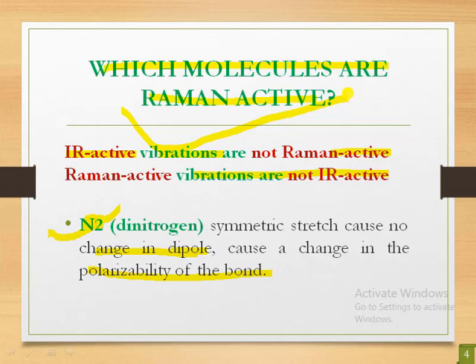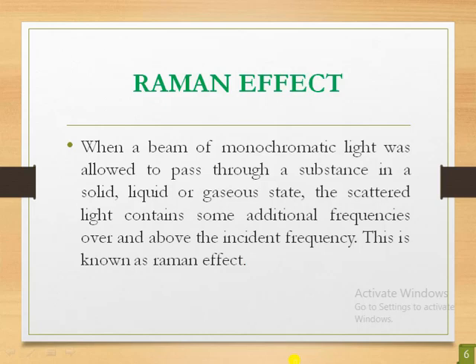Now we will see what the Raman effect is. As you know, in Raman, also like IR, a compound can be measured in any state: solid, liquid or gaseous.